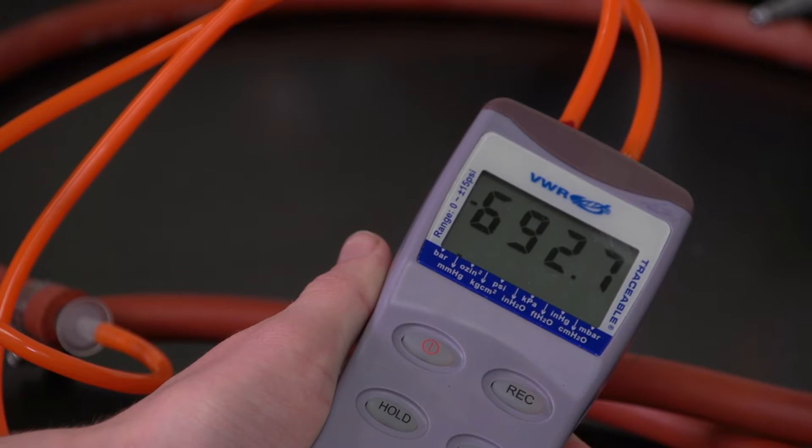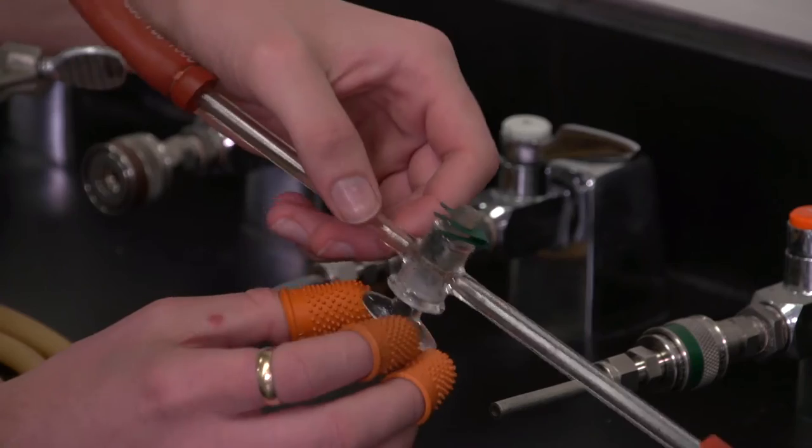When the manometer reading stops increasing, close the stopcock that leads to the vacuum.